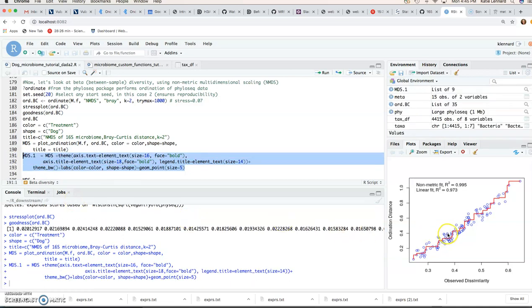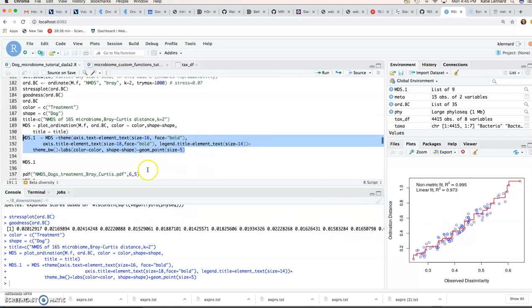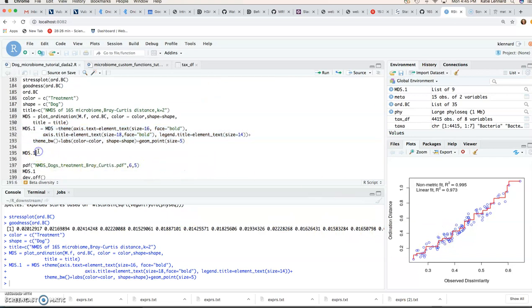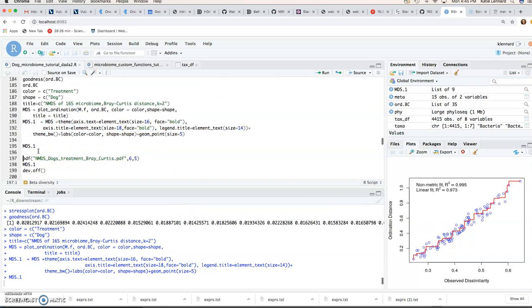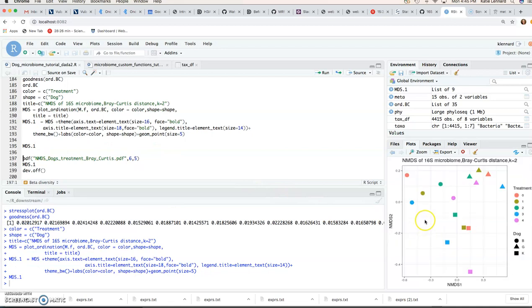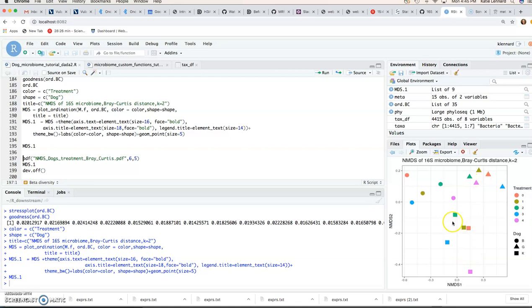So if we now have a look at this mds.1 object, we should see our plot. And there you go. We can see the different dogs. So the triangles will be our dog G. Here we've got dog K. And here we've got dog B.